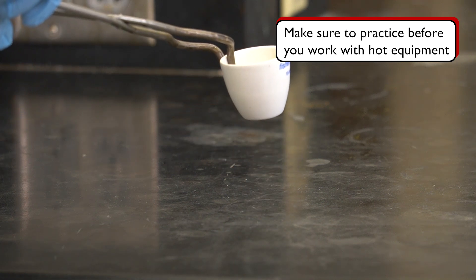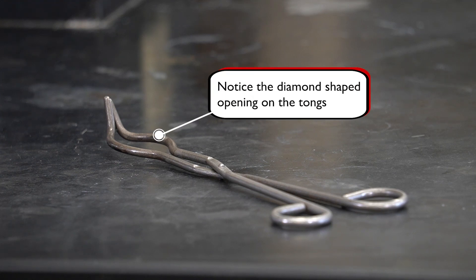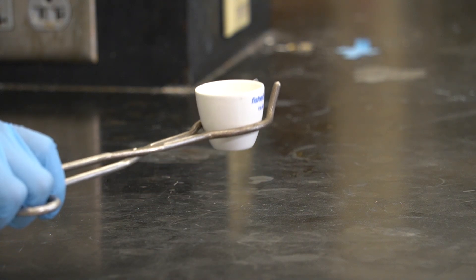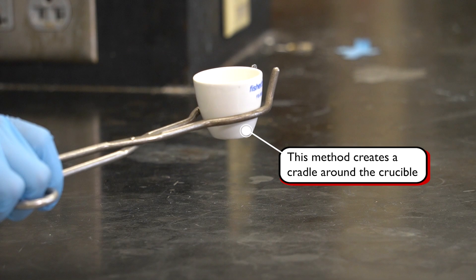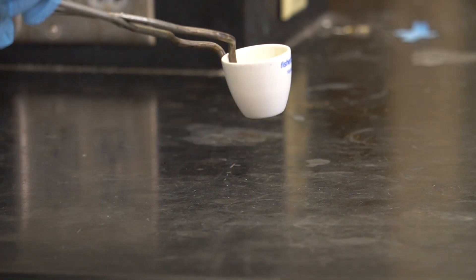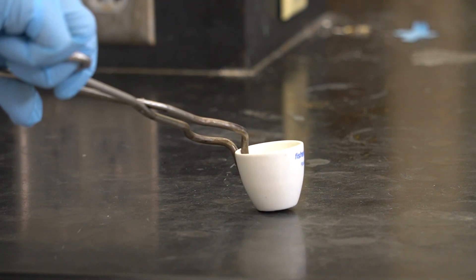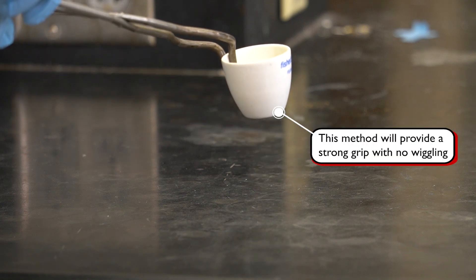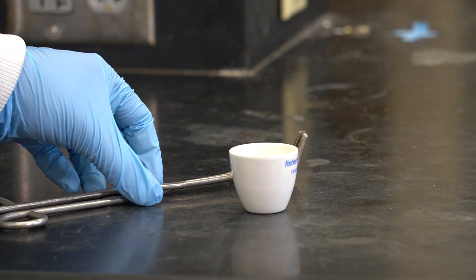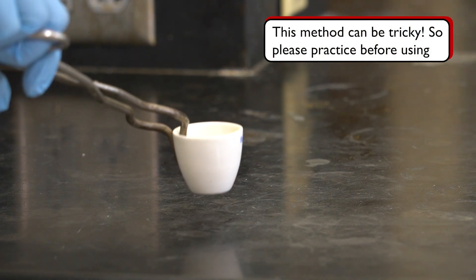Here we'll go over using the crucible tongs, which can be tricky for first-time users. There are two ways to use them. The first method involves placing the crucible in the diamond-shaped middle section of the tongs — hold the tongs with tips pointed upwards, open them, position them around the crucible, and close them. This creates a cradle but does not always provide a tight grip, which can lead to slips and breakages. The second and recommended method is to pinch the crucible with the tip of the tongs by grabbing the side of the crucible, providing a stronger grip and better control.